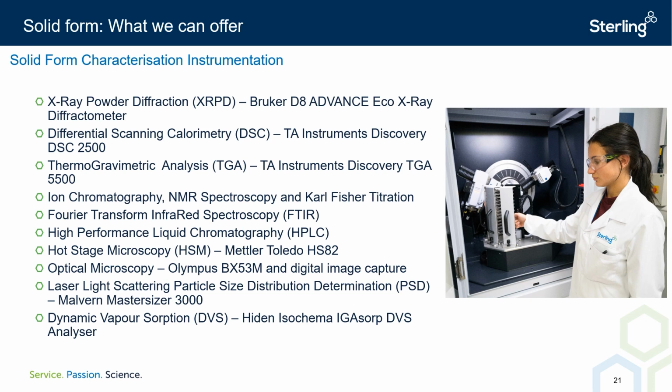We can also perform thermal manipulations, heating the API version to a temperature of interest as determined by the thermal profile, and then cooling again, before examining the thermally manipulated solid by XRPD to assess for potential version change. Variable temperature XRPD, available via outsourcing, could also be employed to get a more thorough understanding of API version behavior across a range of temperatures.